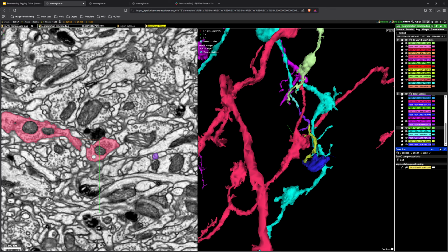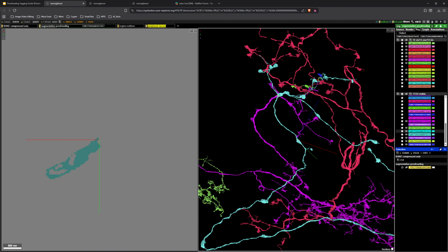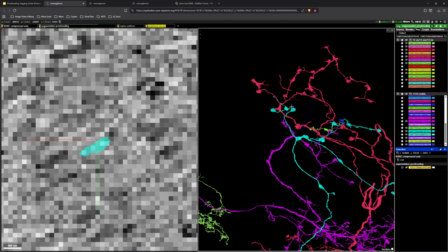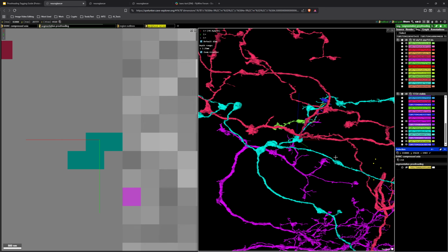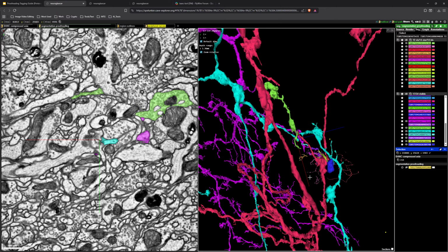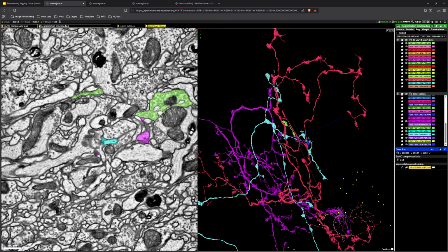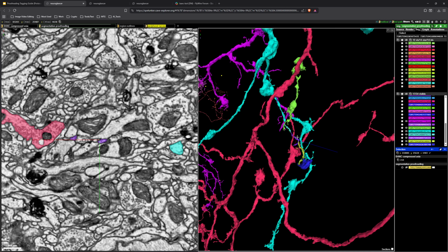Considering this is the backbone, this turn right here and this representative similar branch is actually almost the same size as that branch. So it's good to compare what you find with what already exists as a helpful rubric, as a sanity check, whether or not what you found even makes sense for the cell that you're combining it to.